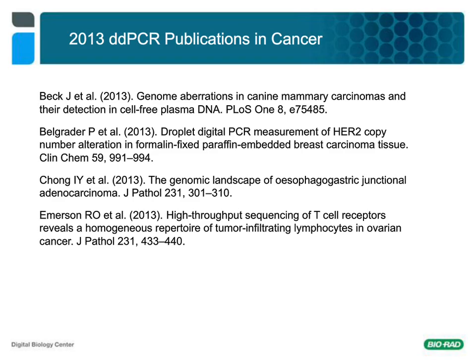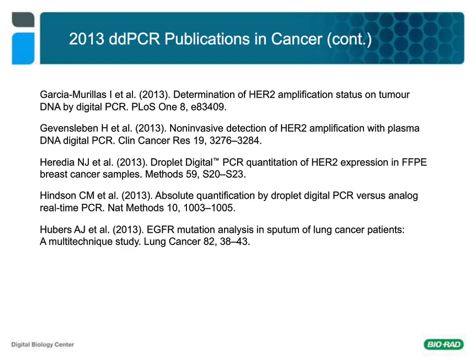How is this relevant to prostate cancer? You can certainly use it for any kind of tissue biopsies. I'm not exactly sure what the levels of cell-free DNA are in prostate cancer. We'd have to look back at the Luis Diaz paper to identify, but I do believe I've seen papers looking at prostate cancer.